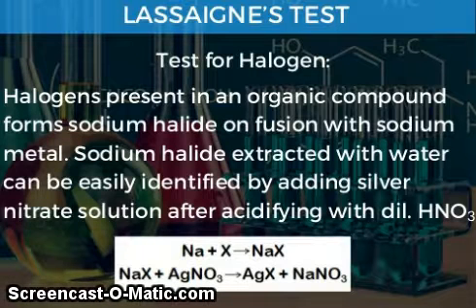Today in this video, I am going to talk about chemical tests, especially for organic chemistry. So first I will talk about the Lassaigne test, the test for halogens. Halogens present in an organic compound form sodium halide.